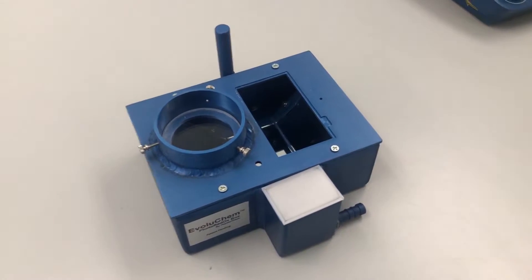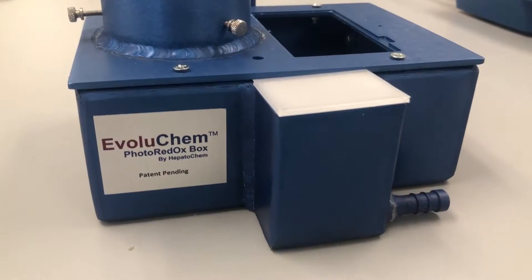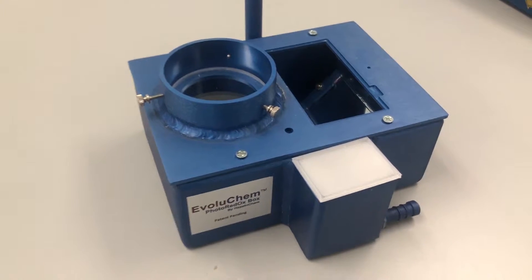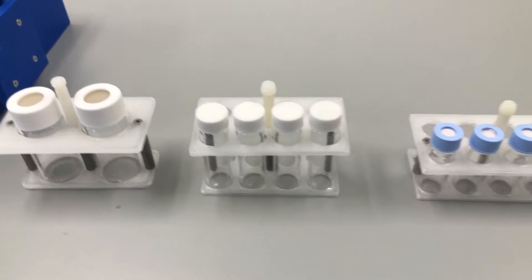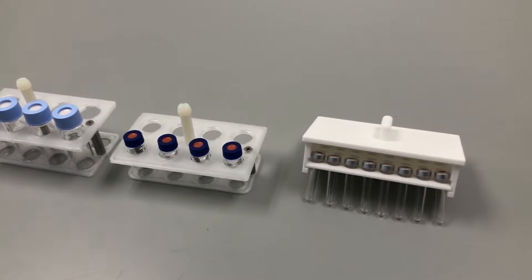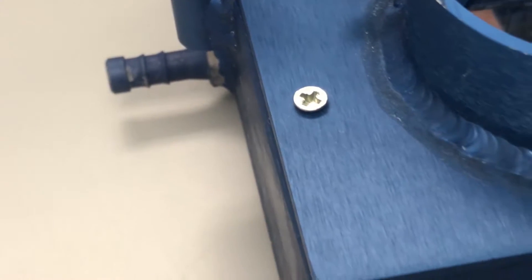Based on our original photoreactor design, the Photoredox Box TC, or temperature control, is designed to work with a standard chiller or heater unit to perform photocatalytic reactions at controlled temperatures between 0 and 80 degrees Celsius. The Photoredox Box TC can accommodate a wide array of vial sizes and is compatible with most stirring plates. Chiller or heater units are attached using the recirculating ports on both sides of the unit, while the unique reaction chamber geometry ensures maximum light exposure.